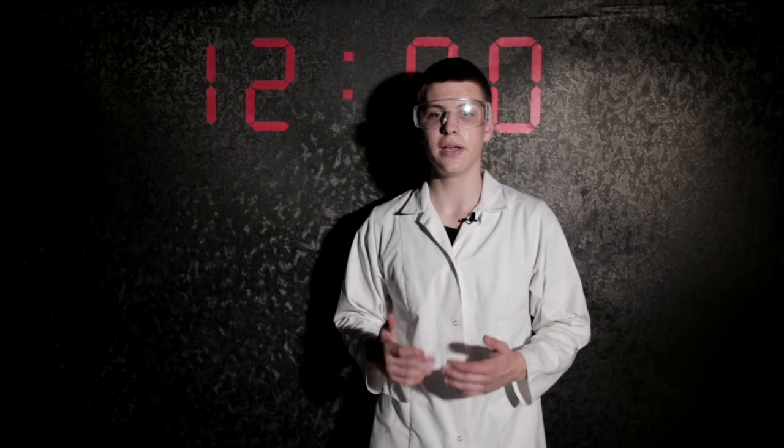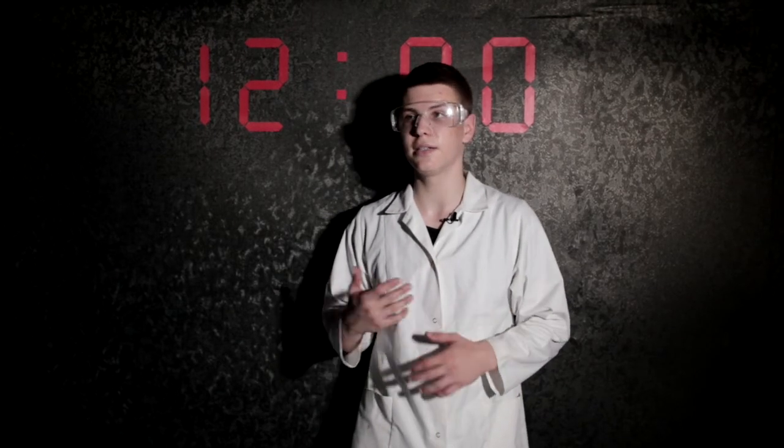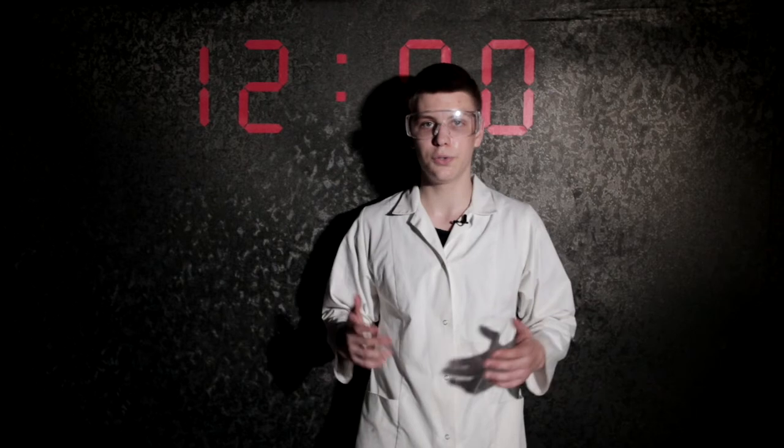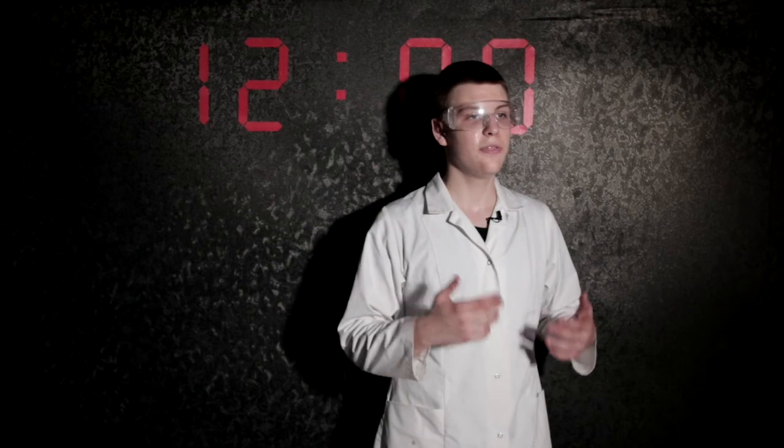It had only some sparks. It didn't have the expected result. So it can be caused by the fact that I stored the aluminum in just a plastic bottle, and it can easily come into contact with moisture. So it makes an oxide layer, and it prevents the further oxidation of the metal. So the overall reaction didn't happen because I had mostly aluminum oxide there, not the aluminum itself.